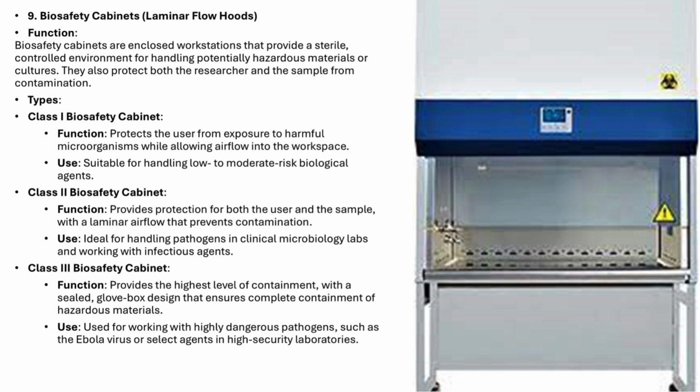Next, let's talk about a crucial piece of equipment in microbiology labs, biosafety cabinets, also known as laminar flow hoods. These enclosed workstations create a sterile, controlled environment, allowing researchers to safely handle potentially hazardous materials, such as infectious agents, without risking contamination. Not only do they protect the researcher, but they also safeguard the cultures and samples being worked on. There are three main types of biosafety cabinets, each designed to offer different levels of protection depending on the level of risk involved in the work.